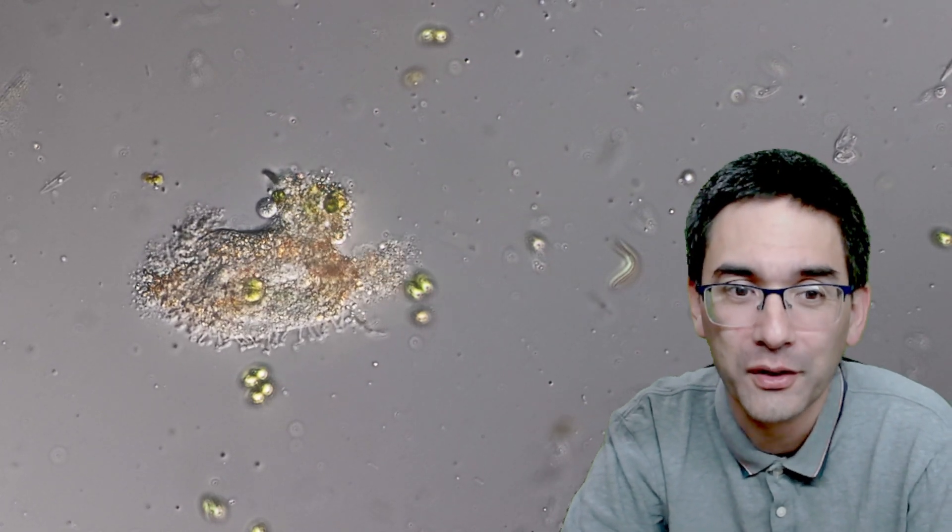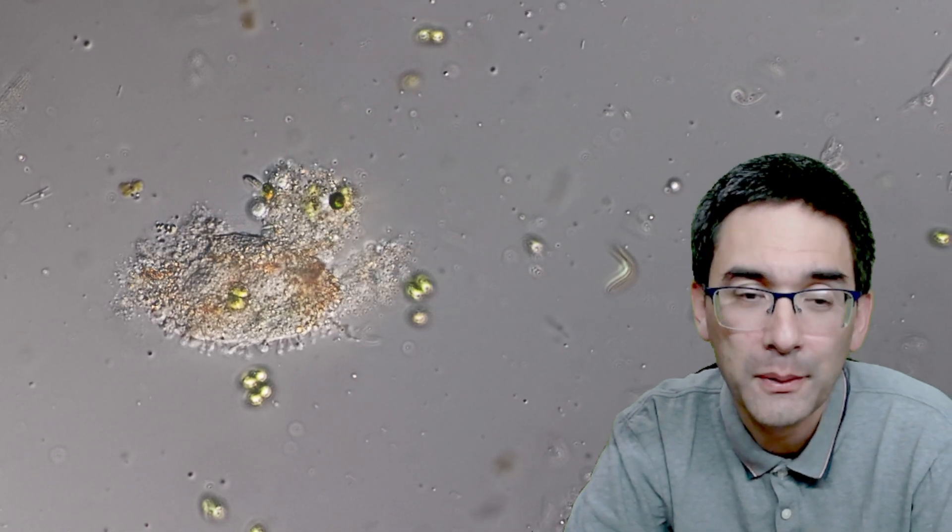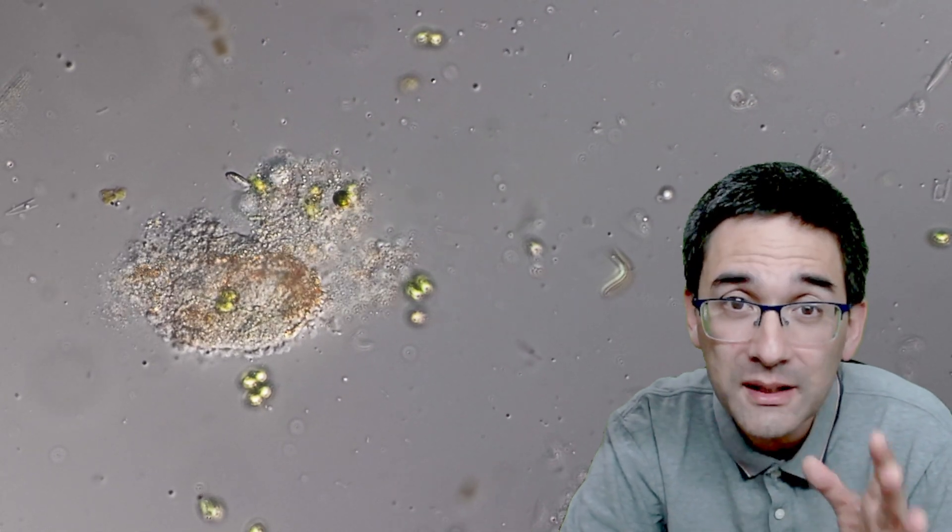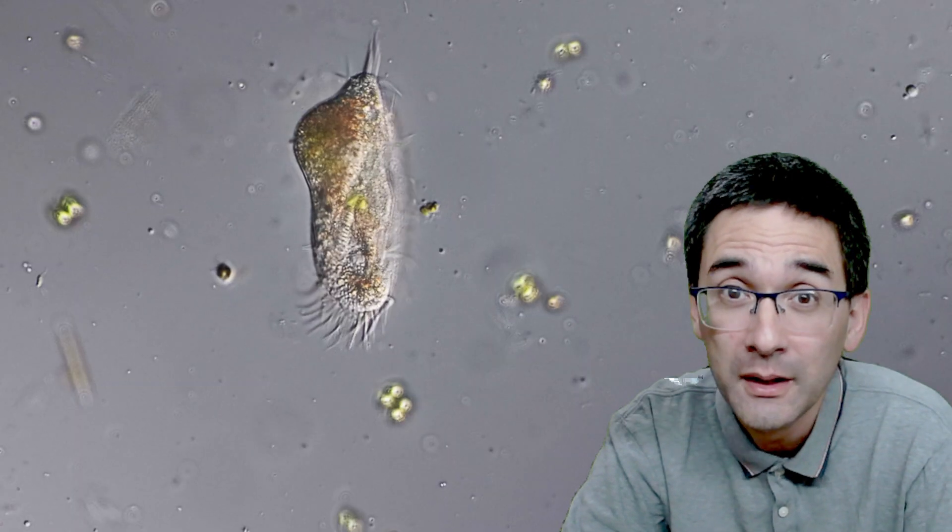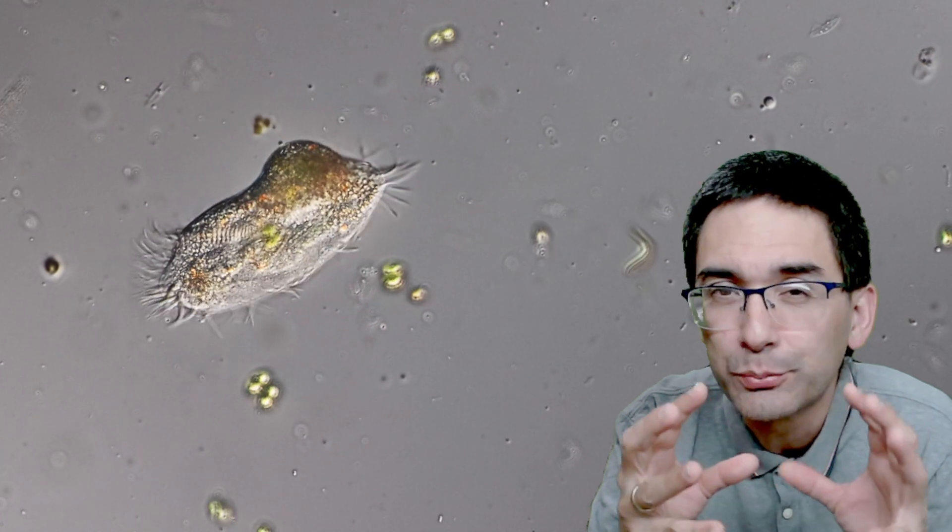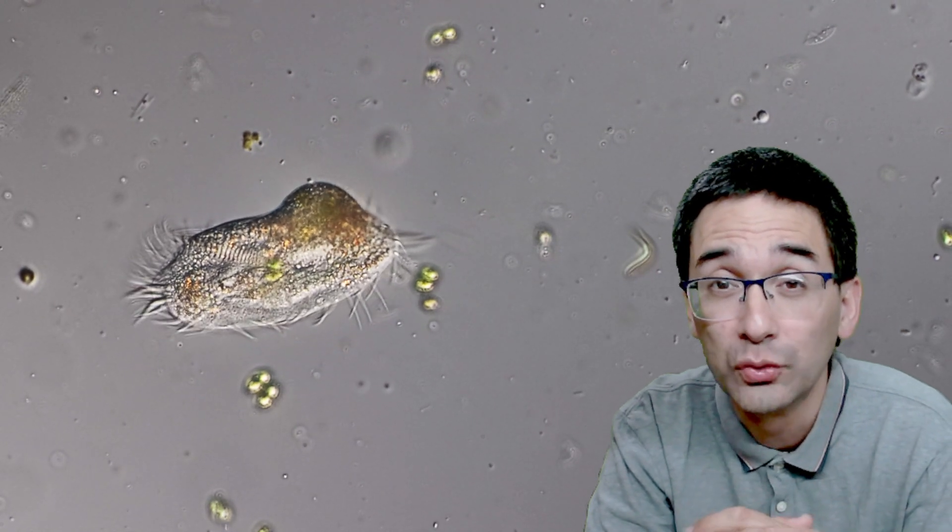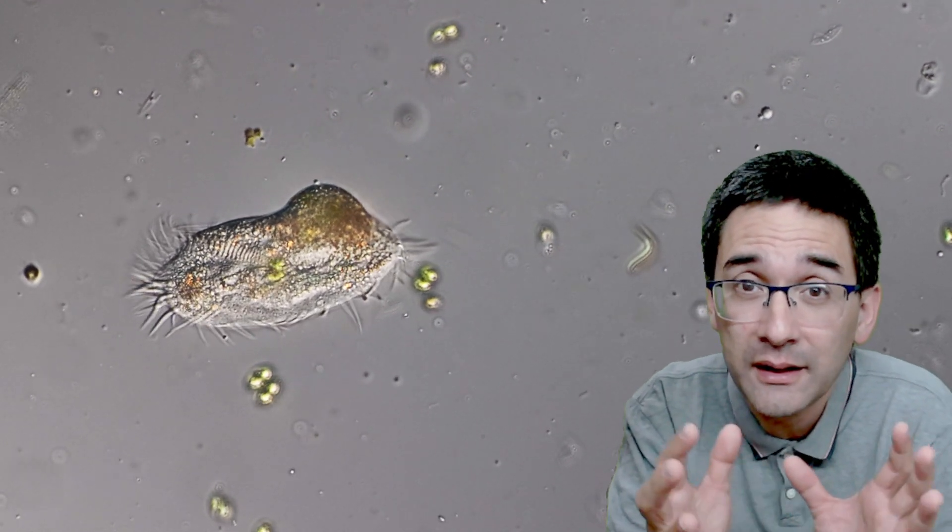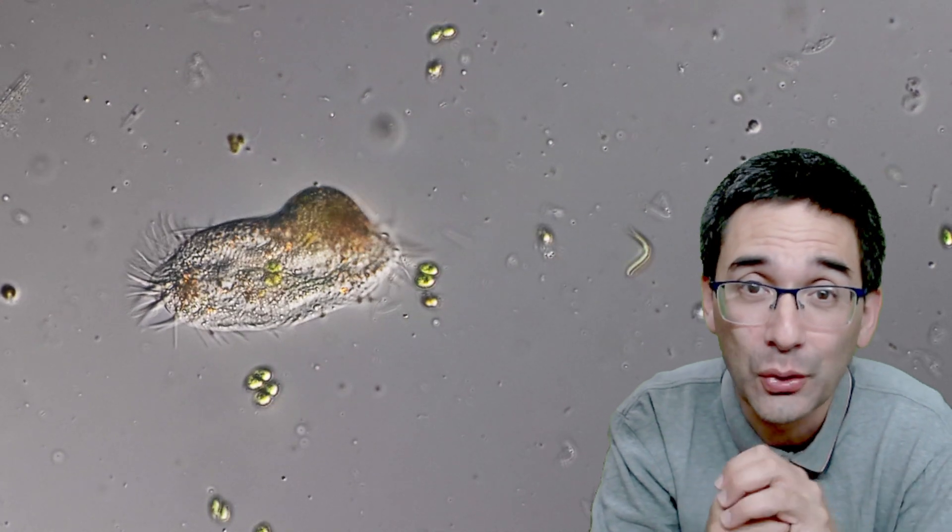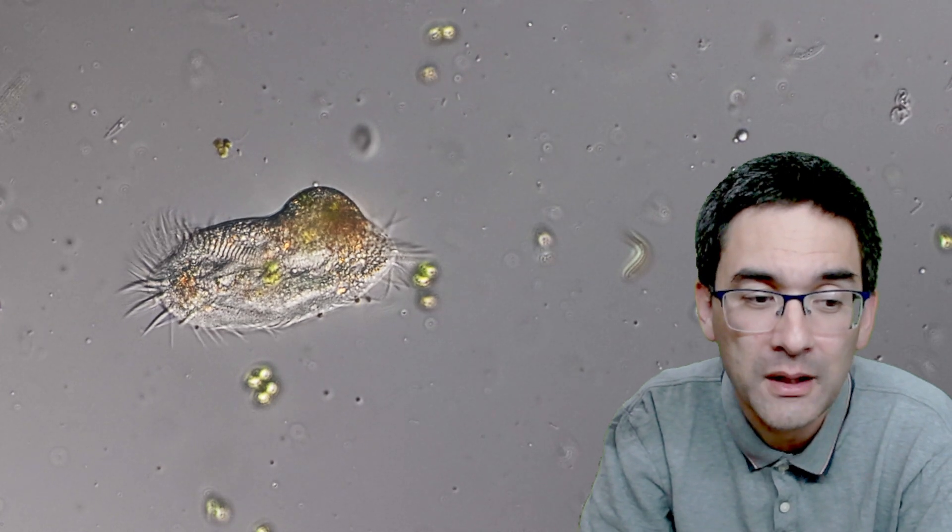It might look a bit drastic, but it's really important that those microorganisms, even though they're not harmful—something similar happens to bacteria. Bacteria also have a cell membrane around them but are significantly smaller, so we're not able to see this process quite as well. Certain viruses, like the coronavirus, have a membrane around them. This membrane, being made of organic substances, also reacts with the hydrogen peroxide. It becomes oxidized and then non-functional.